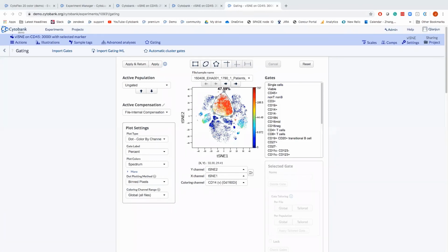Okay. So mass cytometry data versus fluorescent cytometry, if you use it, you know that it has a lot less background. With fluorescence, your negative cells that don't express a marker will usually still have some value greater than 0, right? But with CyTOF data, they don't. Usually negative is 0 in CyTOF data. So generally, for mass cytometry data, any values greater than 0, I think, are meaningful. Excellent. Okay, thank you, Steph.